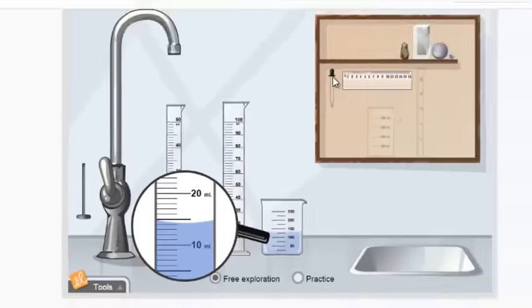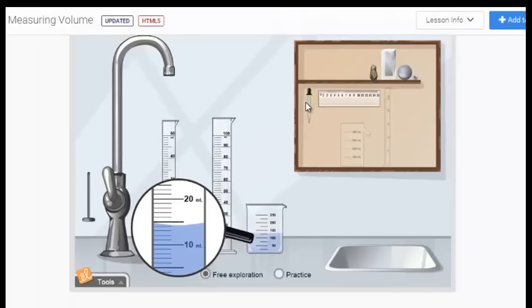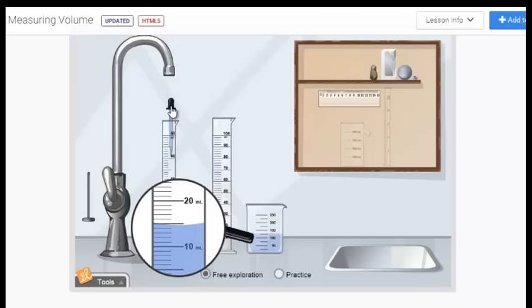There's a really simple way you can get an accurate measurement of volume. What you want to do is take an eyedropper, grab it and fill it up with water. Then all you're going to do is take that eyedropper, put it in the graduated cylinder, and squeeze the bulb to drop water. Every time I squeeze the bulb I'm going to drop some water into the graduated cylinder and the line is going to move up. So I'm going to keep going until my meniscus hits 15.